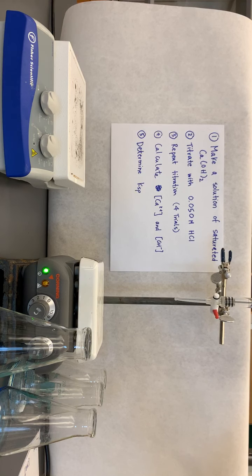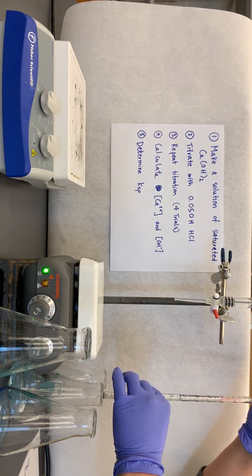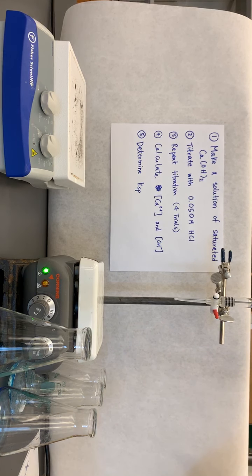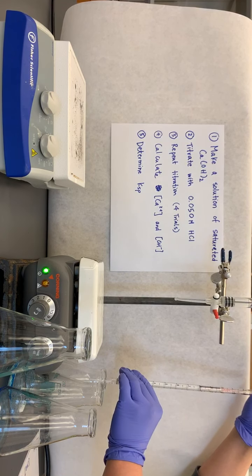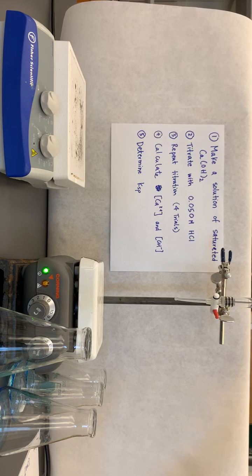My 5 mils there. And last but not least, okay, so I've got 5 mils in every single flask.